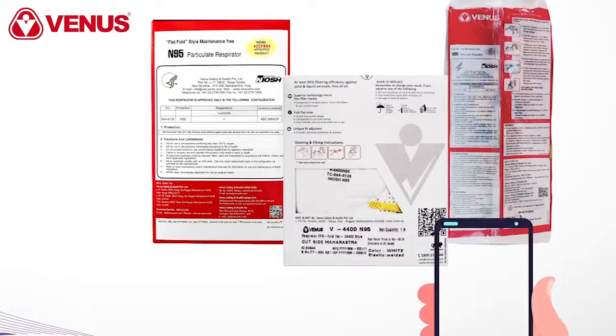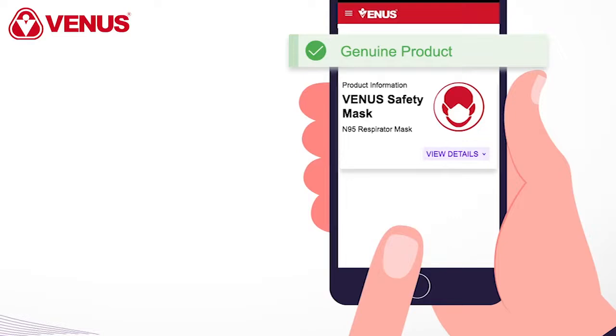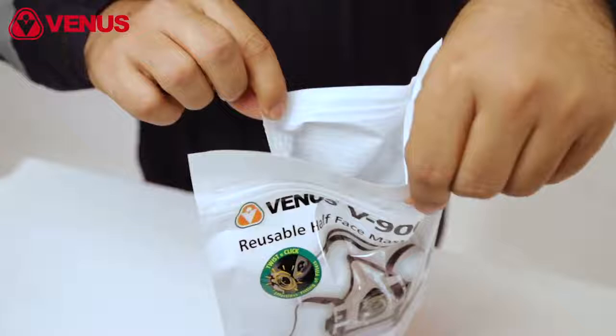Before opening the V900 half face mask pack, scan the QR code at the back. This shall confirm the genuineness of the respirator. If you do not see the confirmation message, contact the Venus team for further assistance.